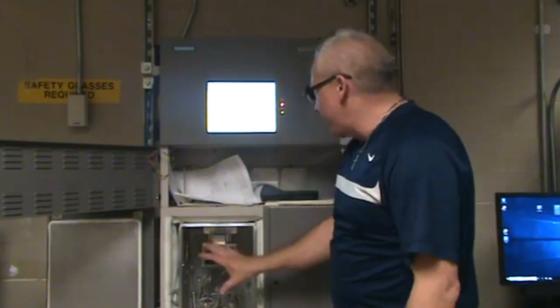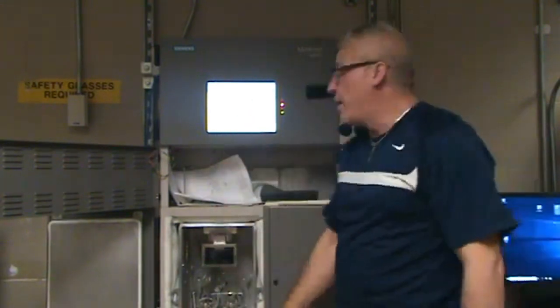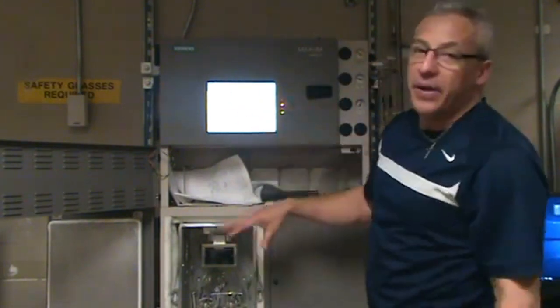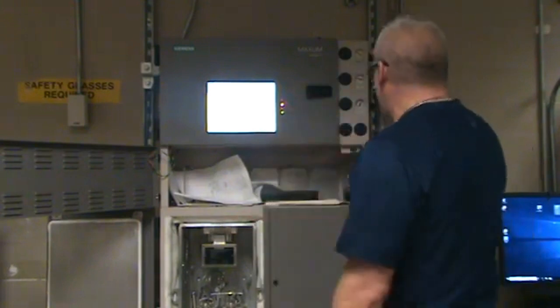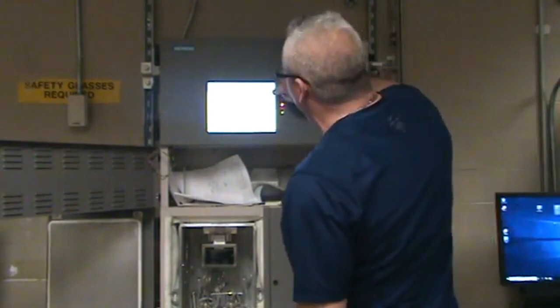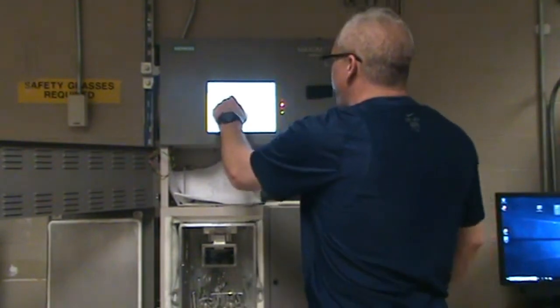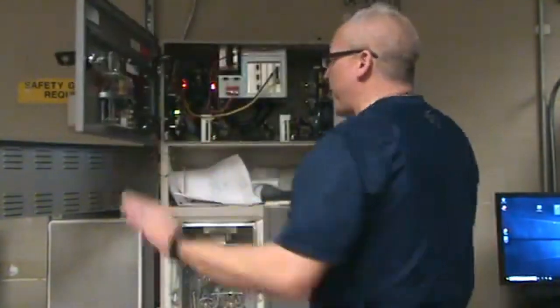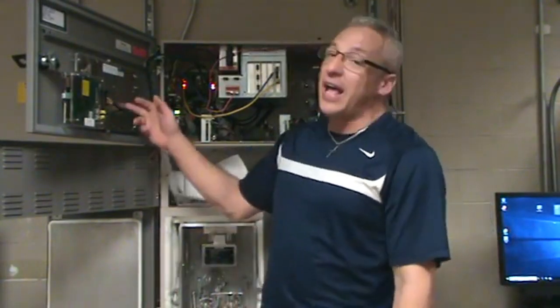So, that being said, let's take a look at our electronics up here and see exactly what we got going on. It's very, very mad because it just woke up. It needs to get its oven up to temperature. I don't know if the HMI is going to play with me today or not. It's not happy, but we can make it work off the computer very easily. Again, this is HMI. They used to be called MMIs, man-machine interface, but no, we can't have that. So now it's a HMI, human-machine interface.